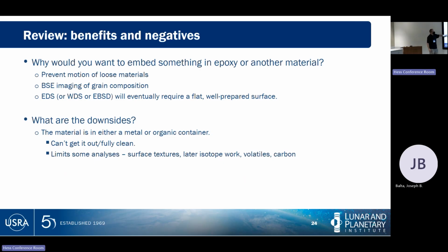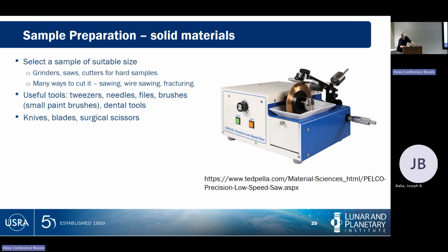And it will limit some analyses. If you are trying to do certain types of isotope work, if you want to do carbon isotopes on your sample later and you're going to mount it in epoxy, you're not doing carbon isotopes on the sample later. So this is what I mean when I say think through the analysis you want to do beforehand.